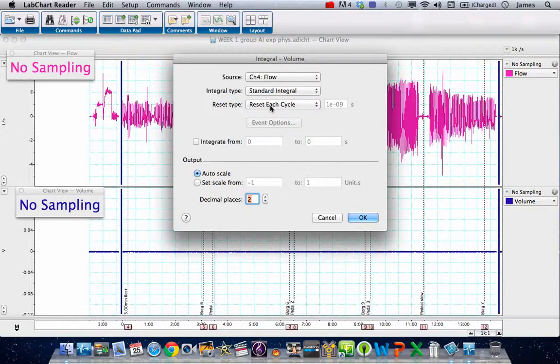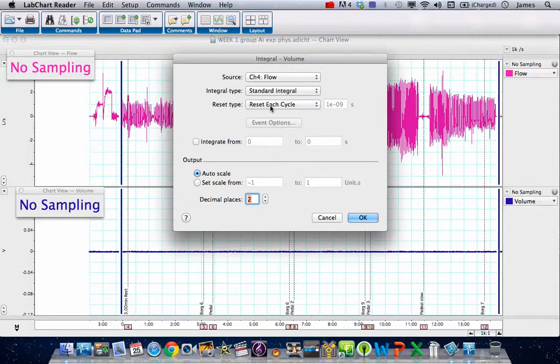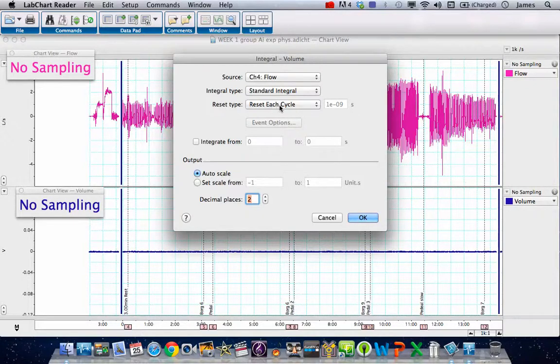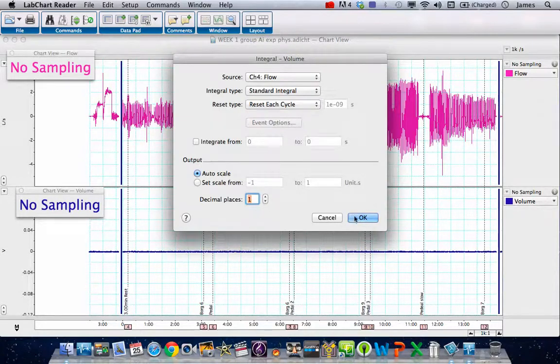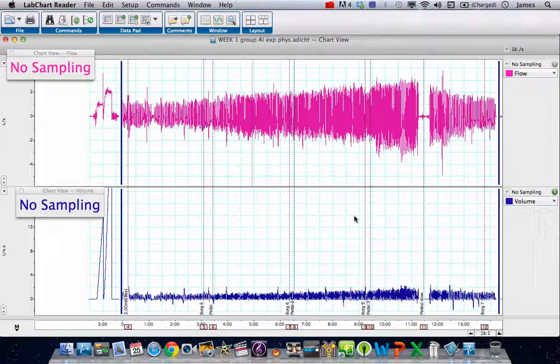Every time the data goes back past the zero line—in other words, in theory the net movement of gas is zero—we're going to reset the integration. You don't need to worry about any other settings except to move the decimal places down to something sensible. Let's leave that on one and then press OK.